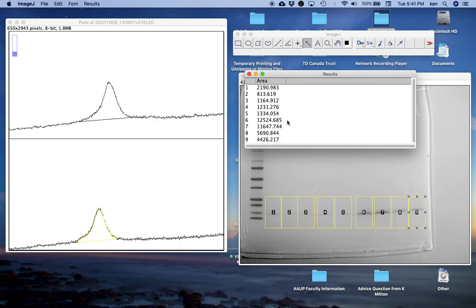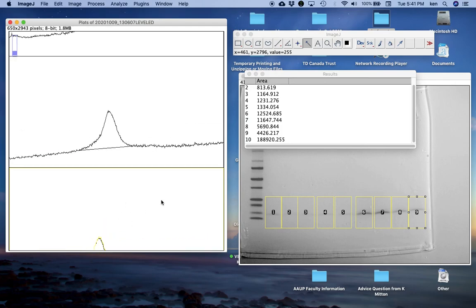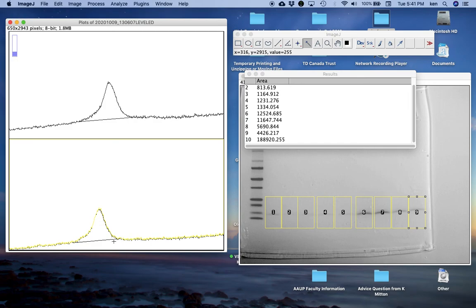If all of a sudden you saw, say, in this group 60,000 or 100,000 or something, what I would guess is you've kind of clicked funny and got a strange result somewhere. And actually, you can see that has happened down here. This last one, it didn't quite get the line where I wanted it, but that's just because you can actually click around live. So there you go. If you get the wrong area, just click it. Now we're all adjusted correctly, everybody should be fine. So you can just keep doing these. It'll keep adding them though.